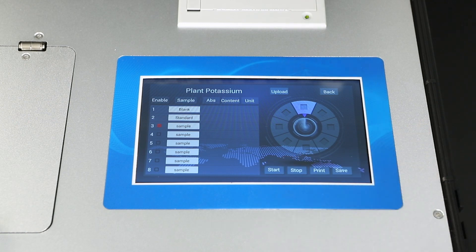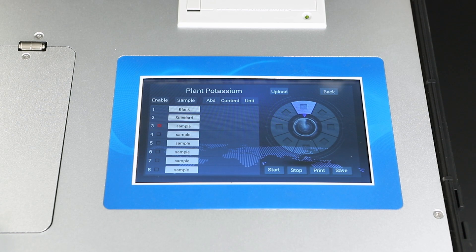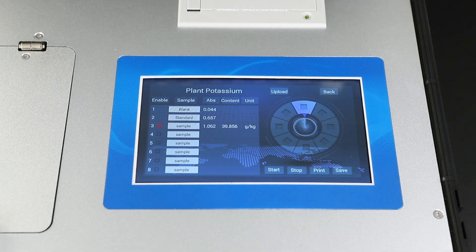Click to start. Wait until the cursor rotation is completed. Read test results.